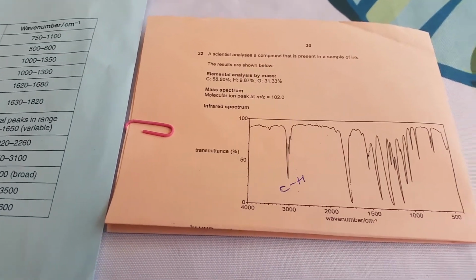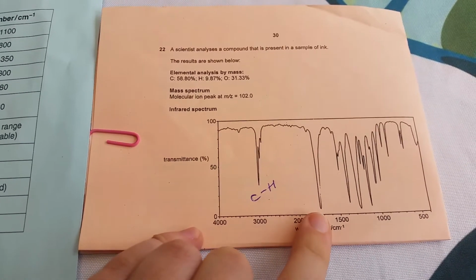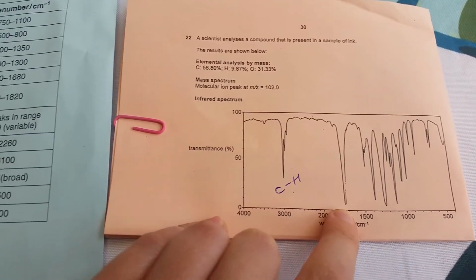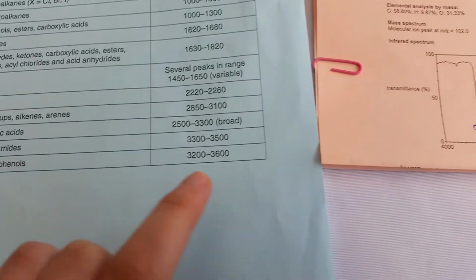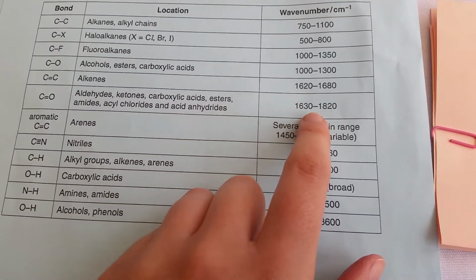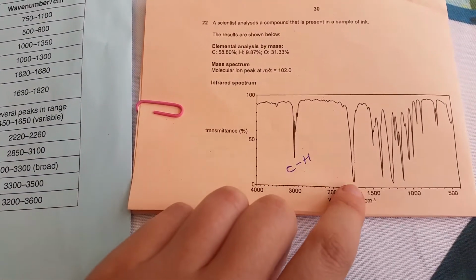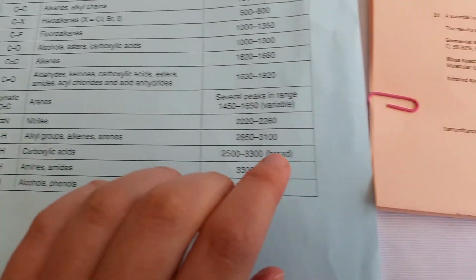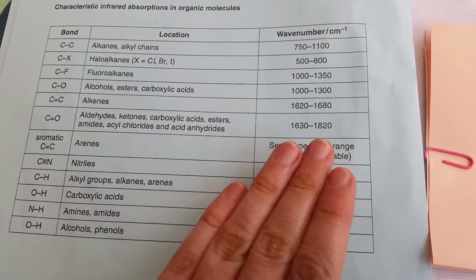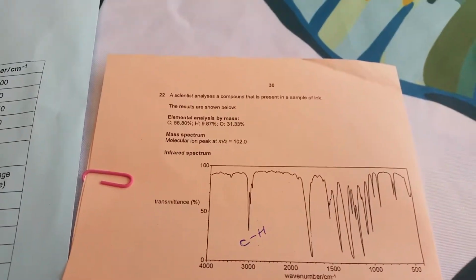CH. Then we've got a bigger absorption, a bigger peak or a bigger trough, around 1750. Now that's a characteristic peak for a carbonyl. So let's label that peak. And this is what we do. We look for characteristic absorptions, big peaks or troughs. We find the range at which they appear on our table, and we just annotate the graph. So we're going to label it CO.